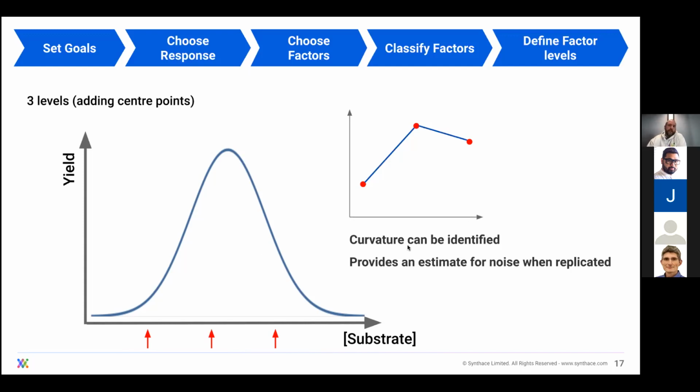The statistical software we use for DOEs provides a checkbox to include a center point in your design. Center points are recommended as they can improve your knowledge of the biological system by assessing non-linearity or curvature, which is something that you won't be able to pick up by varying a factor by just 2 levels. Here, we can see the addition of this center point run, where all experimental factors are set to the midpoint in their defined ranges.